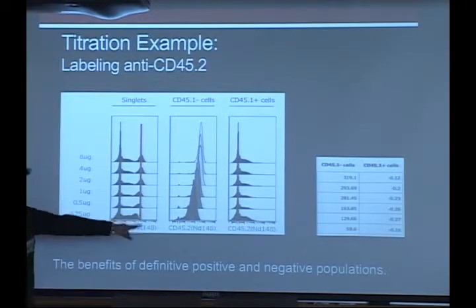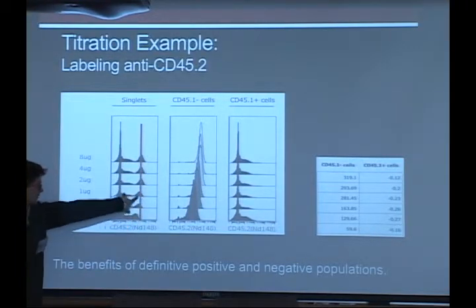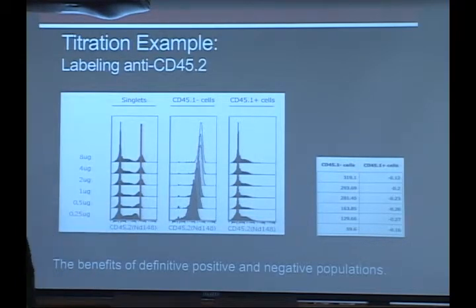And if you look at both of these populations together, you see a very nice bimodal distribution where that protein is either expressed or it's not expressed. So again, about as clear, cut and dry as you could expect it to be. Does that make sense to everyone? The logic, at least? Great.